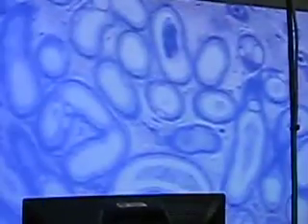For the female, make sure you can identify the different levels or maturation stages of the follicles. On the male, you got one slide of the testes. Basically all you're going to see is something like this. You should be able to differentiate the seminiferous tubules of the testes from the ducts of the epididymis.